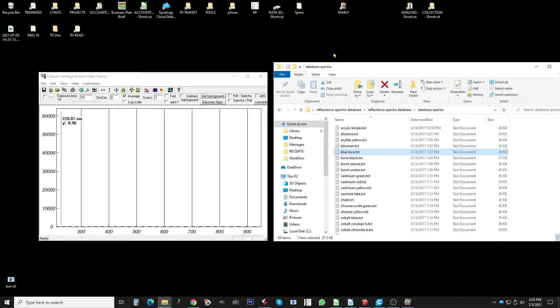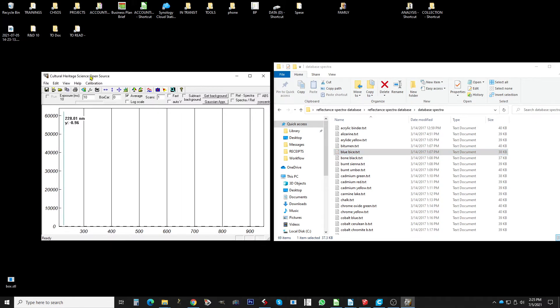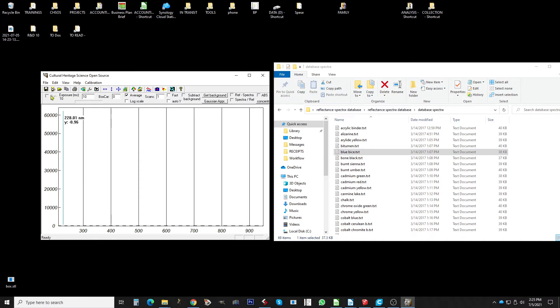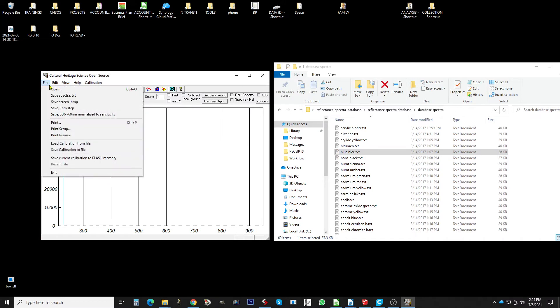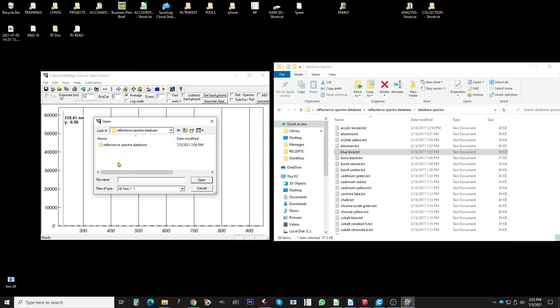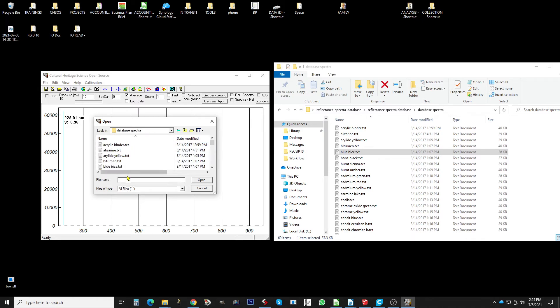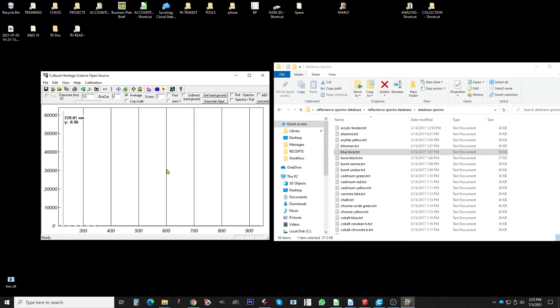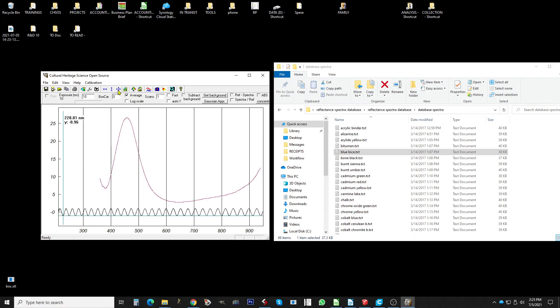But in any case to open with our software, then the Gorgias software, you go in a file open. So we have a spectra database over here and let's open one, blue bice for example. In this moment we don't see anything because the scale is very big, so we need to click this cross over here to adjust to the specific spectrum.